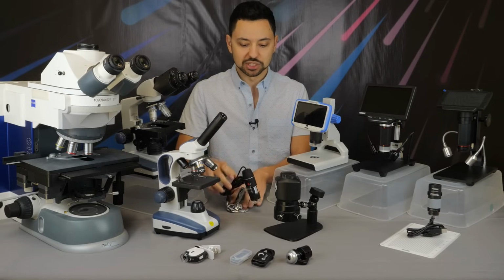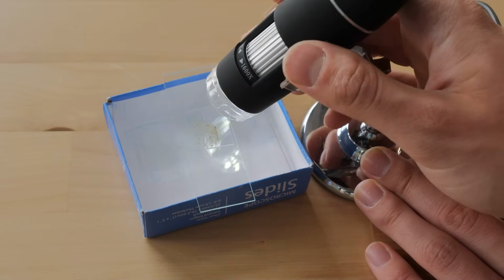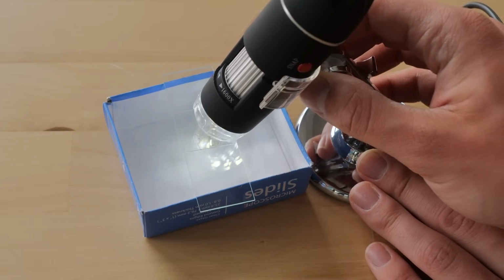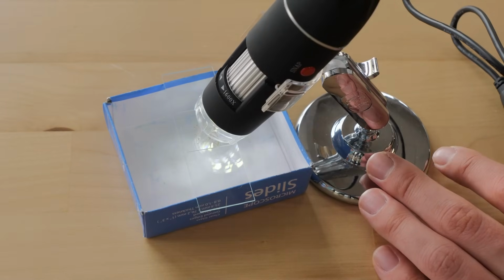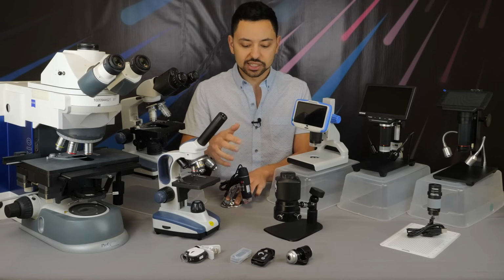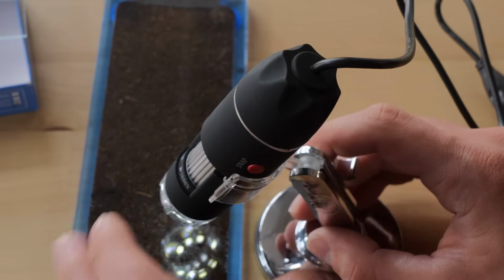The other major problem with this microscope is that the stand itself is very flimsy. The problem being that if you're trying to look at an image or an object with it and you're trying to turn the focus knob here, the entire microscope moves when you do that. And when you're at high magnifications, any small motion of the microscope, if you can see the microscope moving at all, that means on the final image, you're going to see a huge movement. So trying to get an image and actually have it in focus and looking good all the time is really challenging. That being said, again, it's hard to beat $20.